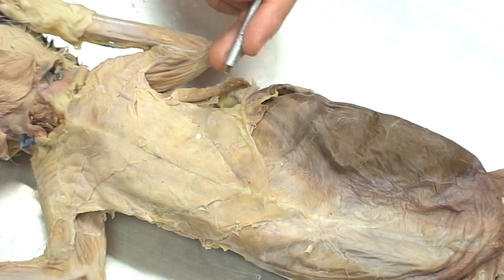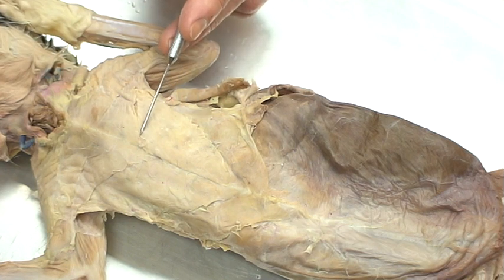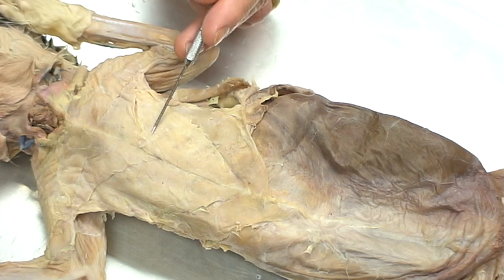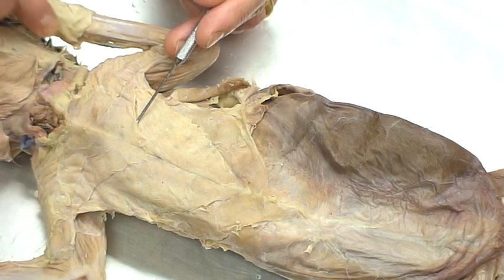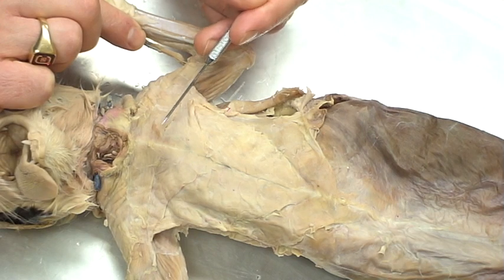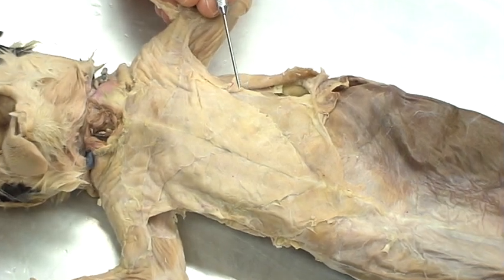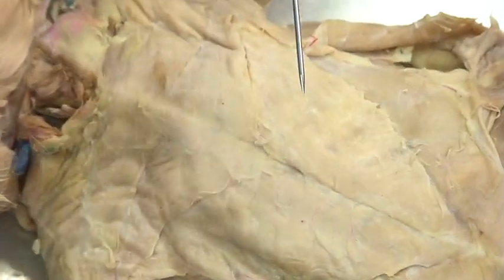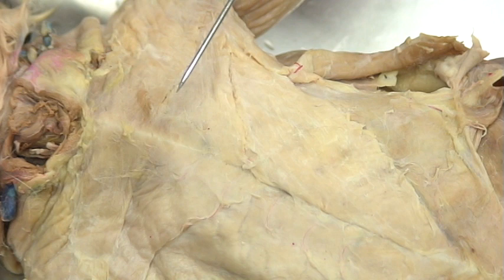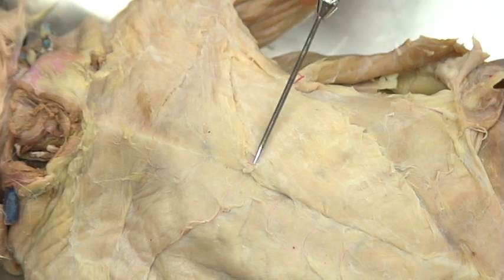The next muscle, from here to here, is actually misnamed — it's named because of the human, not the cat. Even though it's quite large, this muscle is called the pectoralis minor. On the cat, the pectoralis major is actually quite a bit smaller. It's triangular shaped, and you can see the nice triangle shape right here — this is the pectoralis major. Notice that it is much smaller than the pectoralis minor.